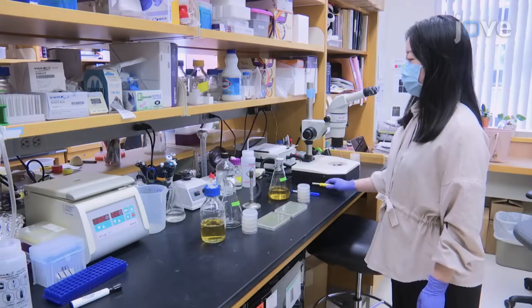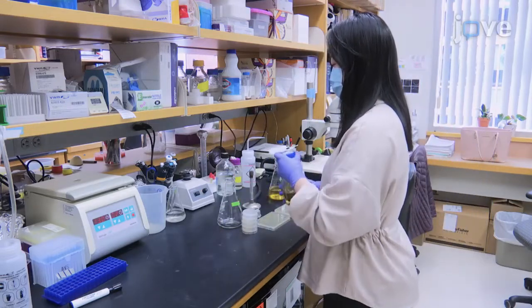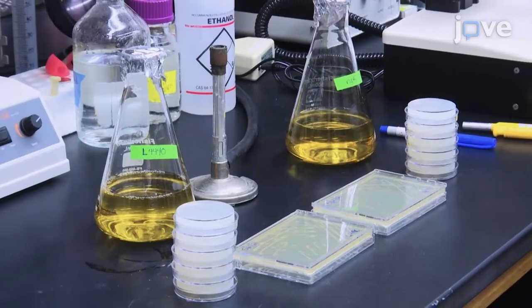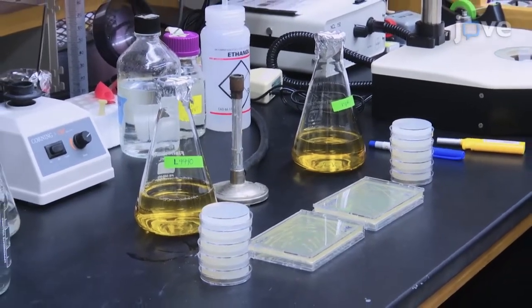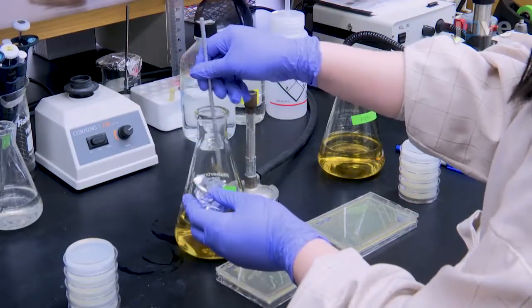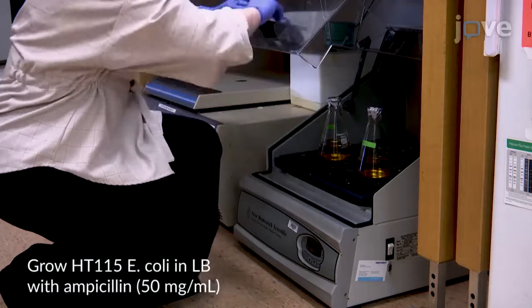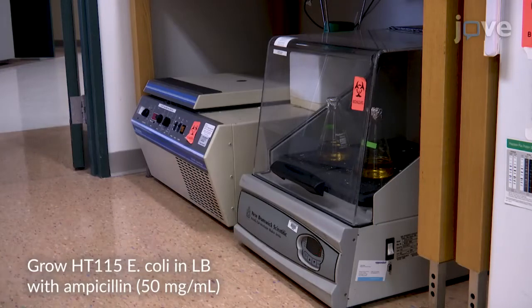Begin by using 6 cm diameter Petri plates to prepare 5 agar plates for each test condition. For experiments with RNAi, induce dsRNA production in transformed HT115 E. coli and use RNAi agar. Use OP50 E. coli on standard NGM agar for experiments without RNAi. Grow the E. coli cultures overnight at 37 degrees Celsius while shaking at 220 rpm.